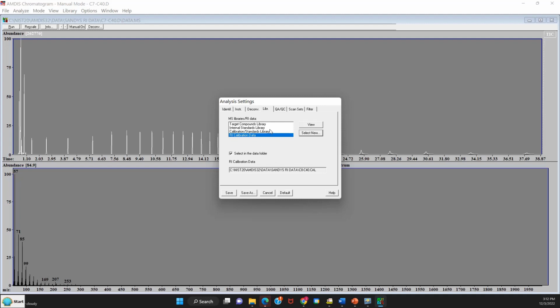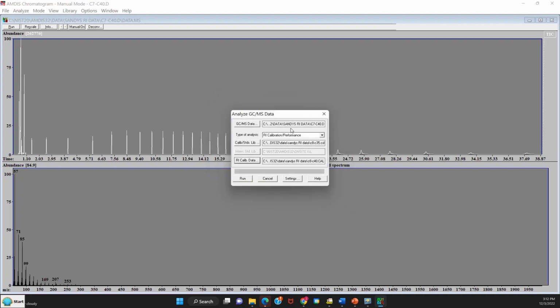And say open. Okay, it'll create it because it didn't exist. So I'll just go back. Now I've got everything I want. So I said save. So I have my file that I want to process. I want to calibrate. I have to use this option, and that's where I want to save it. And I'll say run now. When I do that, it says it's going to overwrite or create this new file, and I'll say okay.